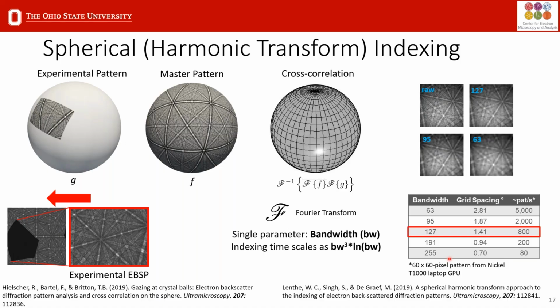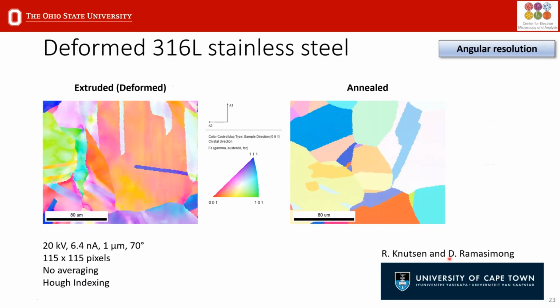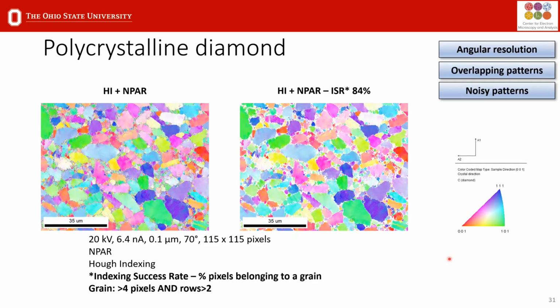Perfect, thanks. Okay, another question. It says you showed NPAR worked well for your TKD results, but you'd mentioned NPAR can also blur results. Is there a step size recommendation to avoid the blurring you mentioned?